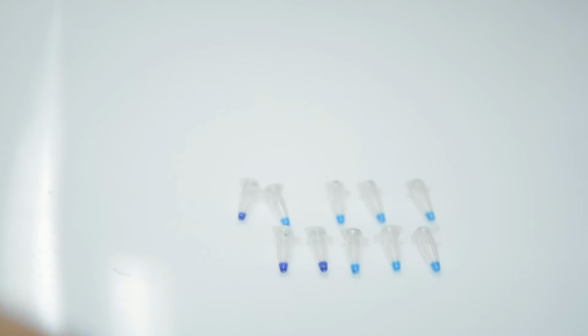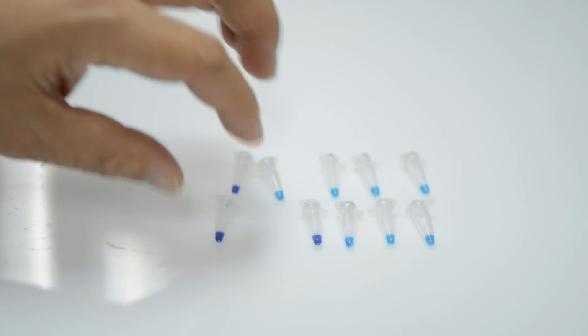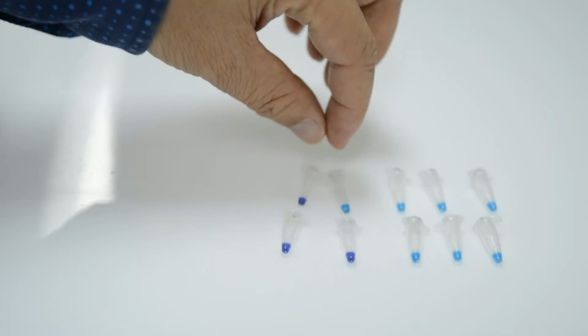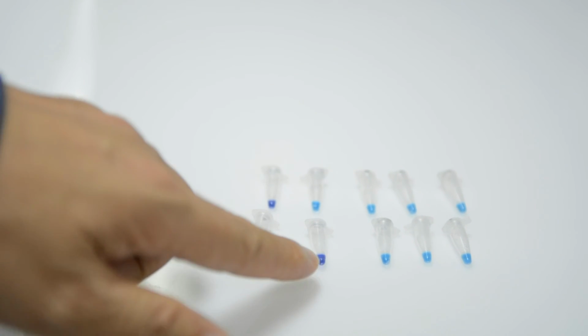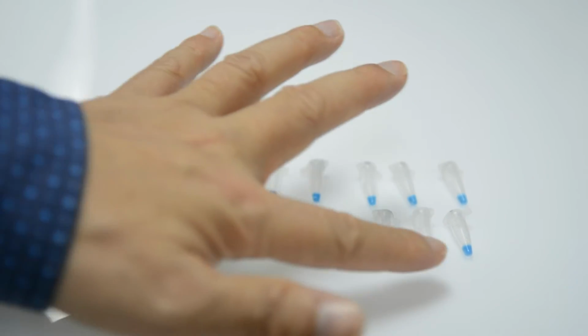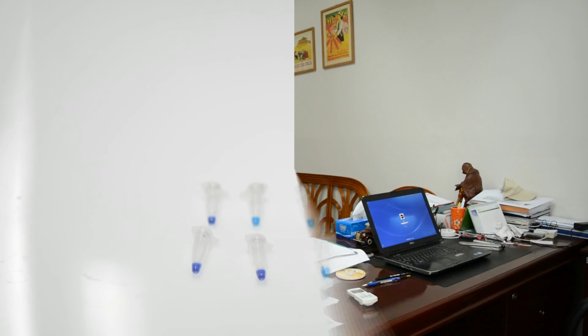In the lower part, you will see that we are detecting the target gene of the phytoplasma. This is a negative water control, with no reaction. These are healthy plants. The DNA was good, so there is amplification in the upper part, but there is no phytoplasma in there. And these three samples are infected samples we collected from the field. So now you can easily distinguish between diseased and healthy plants for cassava witches' broom disease.